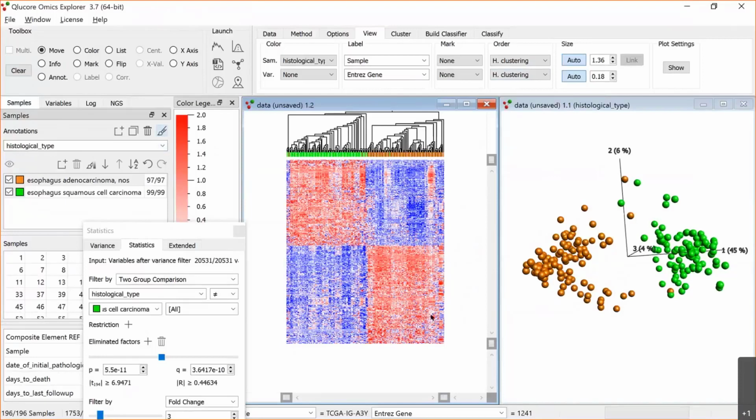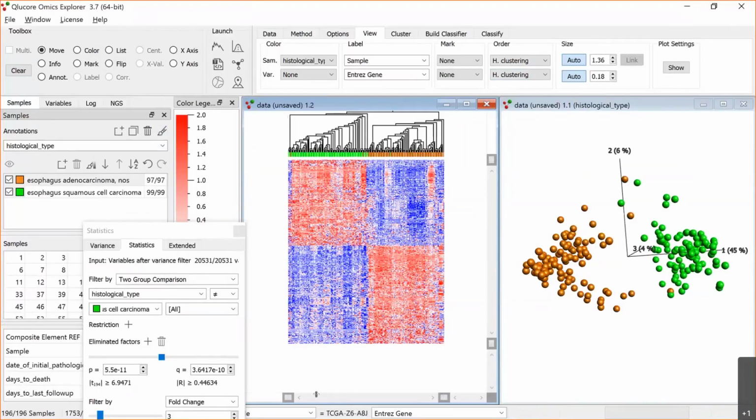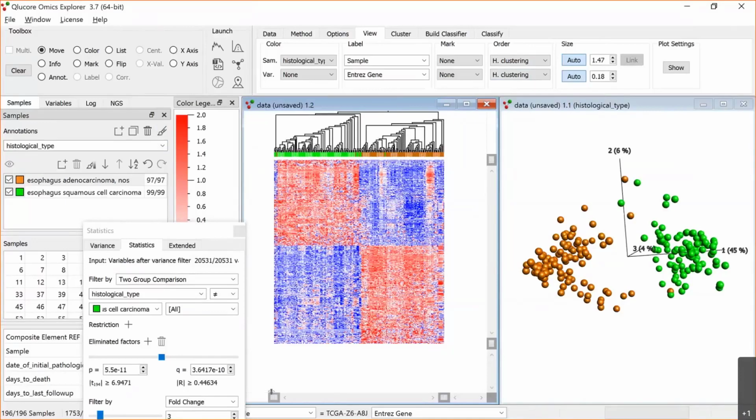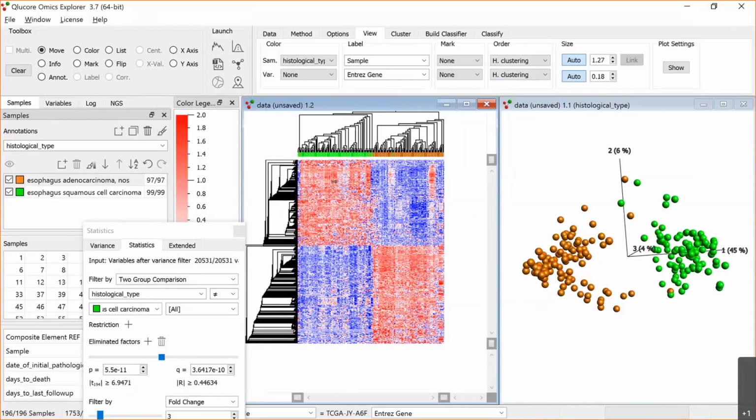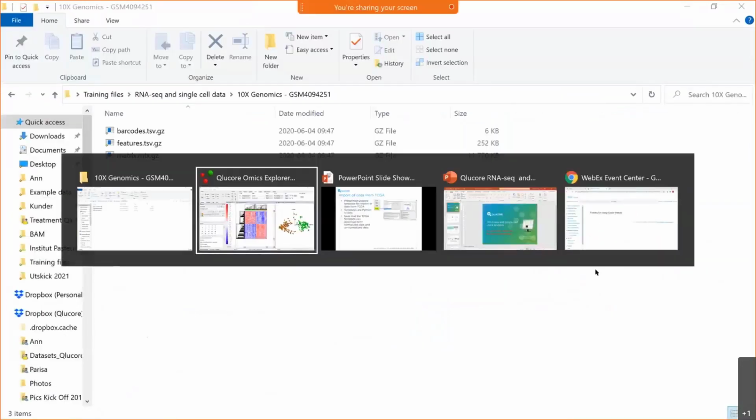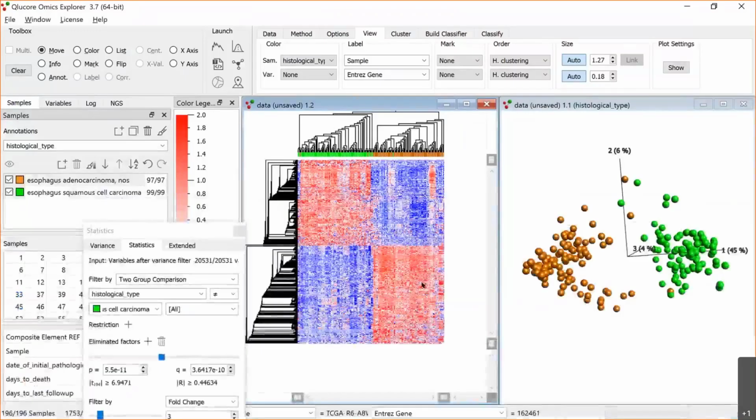And here we are. Yeah, there was the network. So it becomes a bit slower when you go over 1000, as you can see. But here we see we have very clear signals here. Okay, so there you have a gold mine of interesting cancer data to dig into if you're interested.